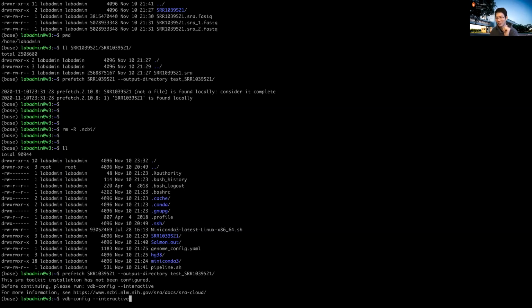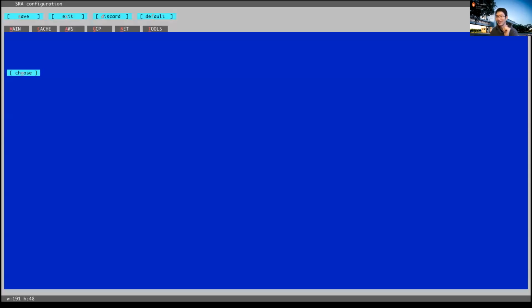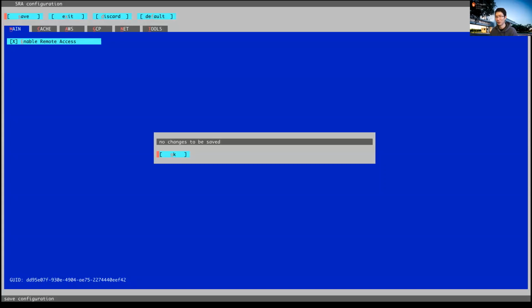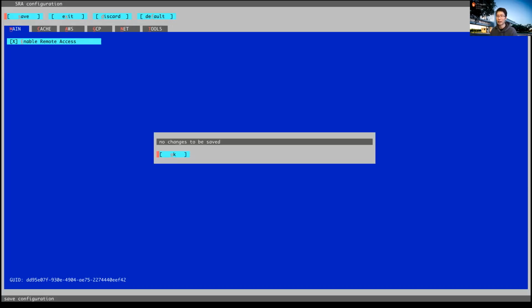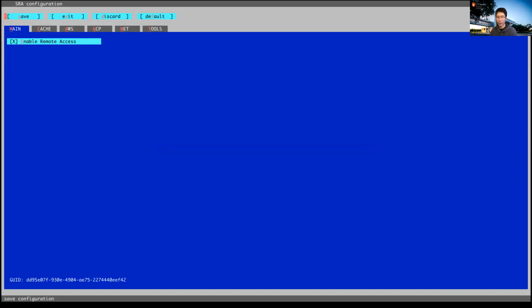I think everyone already deleted the .ncbi, right? It's probably too late, and we don't need to do anything actually. So you just hit S here, it stands for save. Okay, and then exit. I think that will do it. Everyone with me? So do the S, small s, and it's saved. Just hit OK, and then do the X right here, so you exit.